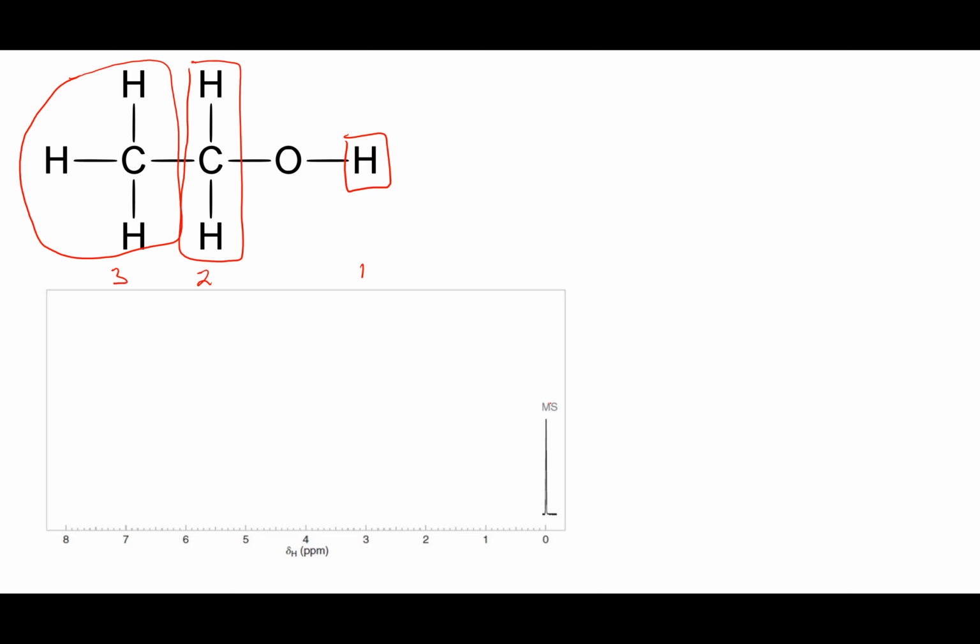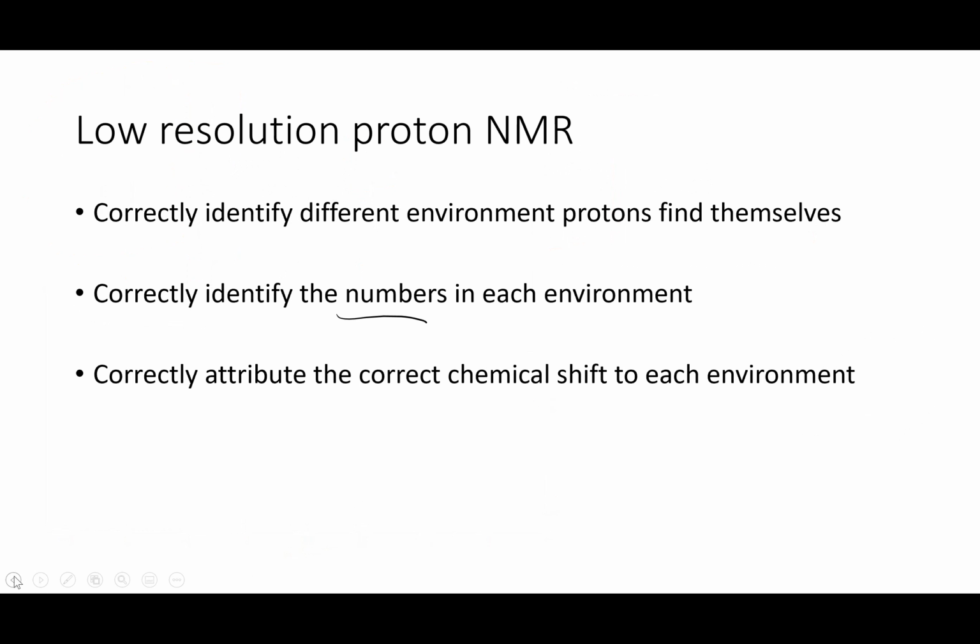Okay, so here is what's been missed out. This is the tetramethylsilane, which is set to give us a base at 0 with the highly shielded protons that are in that. So if you go to page 17 of your data booklet, if I skip back just a wee bit, then we can see that these alkane-type hydrogens, protons, have got quite a low value. There's not a lot of de-shielding going on in that, because they're not attached to particularly highly electronegative atoms at all. So we're going to have quite a low value in that one, just round about over 1.